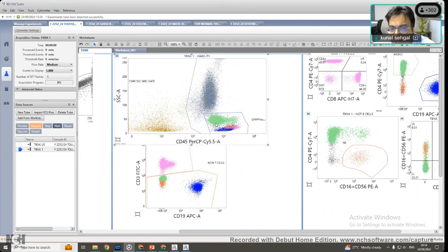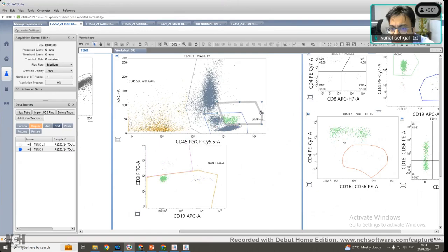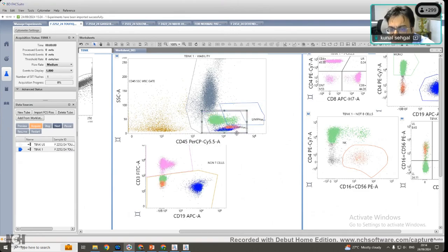Can you see there are 2 populations of monocytes? One to the left over here. Can you see these brighter monocytes which have brighter 45? A significant population of these express CD16 and are actually called non-classical monocytes. We will not go there, but my idea is to tell you that monocytes express 4.